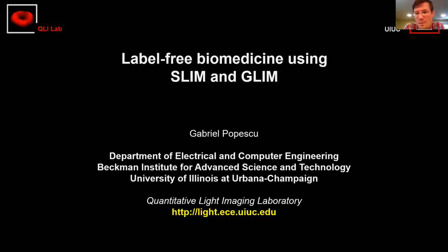So more specifically, to microreology, we used phase imaging a while ago now, starting when I was a postdoc. I started in 2002, but we have a series of papers on microreology of red blood cell membranes. So these membranes are special in the sense that they have not just the lipid bilayer, which all the cells have, which is completely viscous. The oil cannot store energy, right? But underneath is actually backed by a protein mesh.